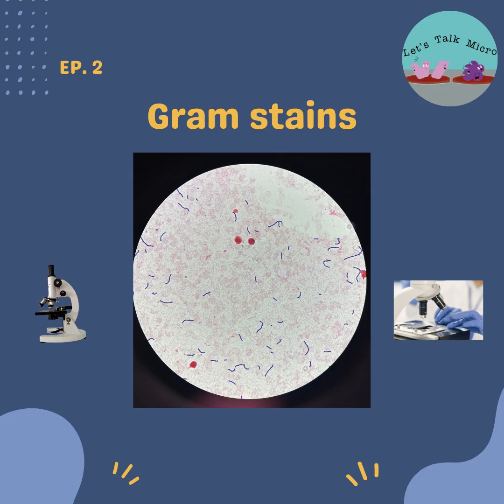And then Hektoen and XLD are also differential for lactose fermentation, but instead of turning pink, it turns yellow. And it is also differential for hydrogen sulfide production, H2S. So this is where, when you have your stool cultures and you plate your stool in there, colonies that are an H2S producer will turn black. So that's one of the uses for that agar.